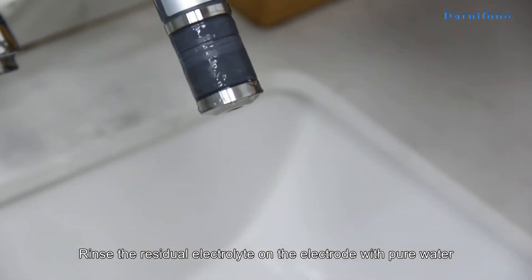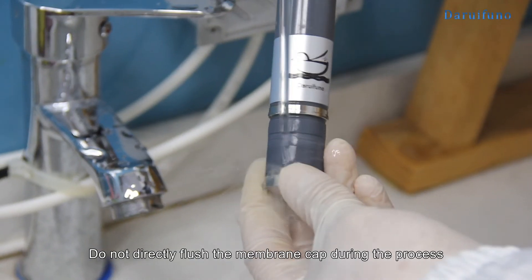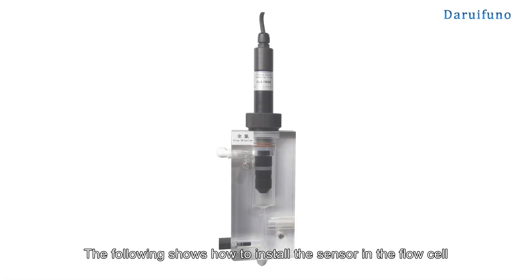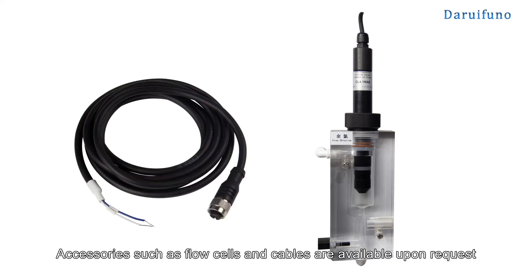Rinse the residual electrolyte on the electrode with pure water. Do not directly flush the membrane cap during the process. The following shows how to install the sensor in the flow cell. Accessories such as flow cells and cables are available upon request.